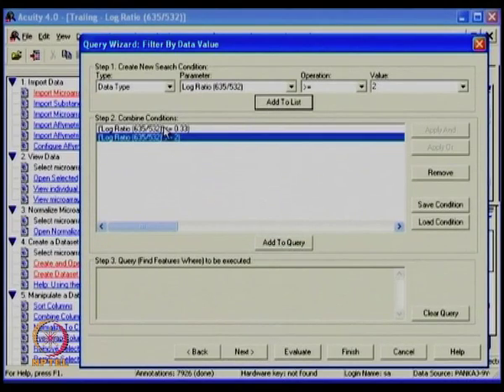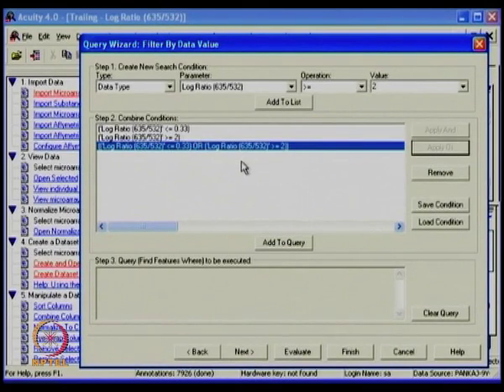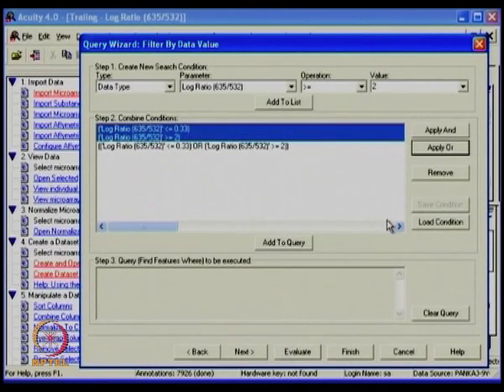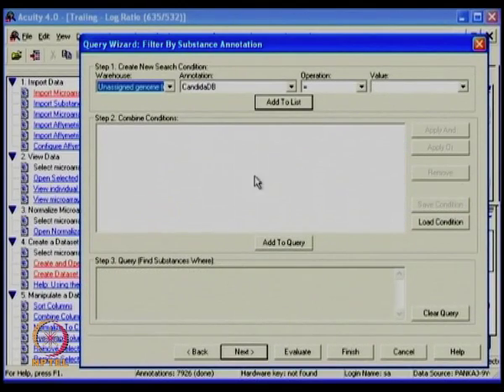If I select both of them, I can create an OR, and you can apply OR so that any feature which is this or that is selected for my import. So I will be able to just add a query on this to the final wizard and then you have the data available for you coming out.